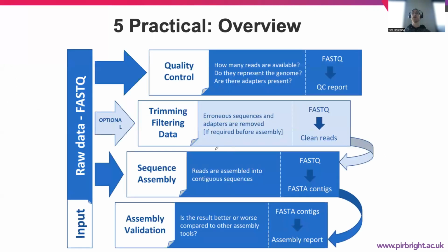So what we're doing is bringing ourselves through from the initial stages where we're looking at QC, doing trimming and filtering and all the rest on our data, so that we can now assemble our sequence and then also look at the result to see if it actually worked well. And because we're looking at multiple attempts of assemblies with different k-mers, that can be complicated.